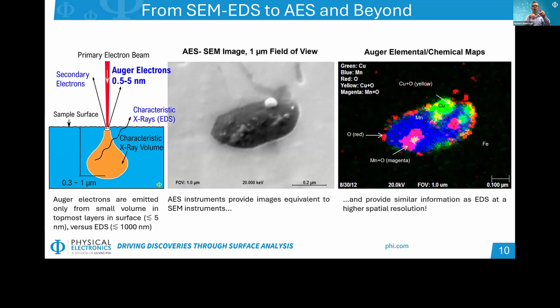The SEM image in the center of the slide was taken on an iron sample where manganese sulfide was intentionally included. Manganese sulfide is sometimes added to steel to improve its machinability. However, it can lead to corrosion pits in the surface, like the dark spot shown in the center of the SEM image, potentially leading to larger material problems down the road. Corrosion costs the global economy about $2 trillion annually.